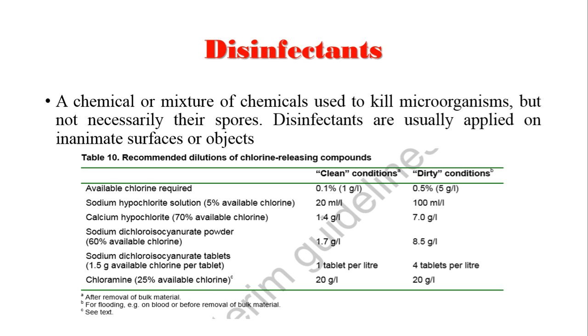You might have seen nowadays, because of this COVID-19 outbreak, various people are spraying some liquid chemical onto vehicles and on roads and surfaces. That is basically these chlorine based solutions only. In that too, mostly it is sodium hypochlorite solution, right? So this kind of chemical can be used. Different chlorine based solutions are available.